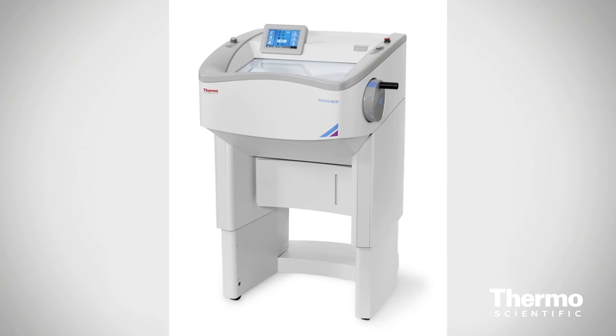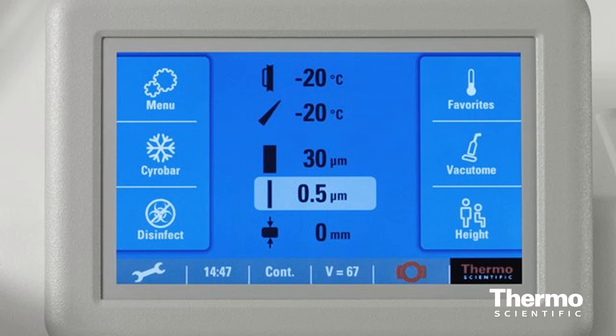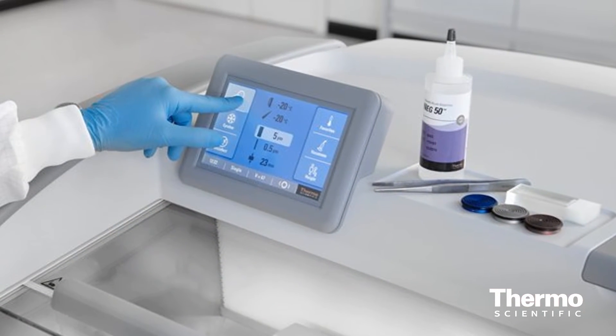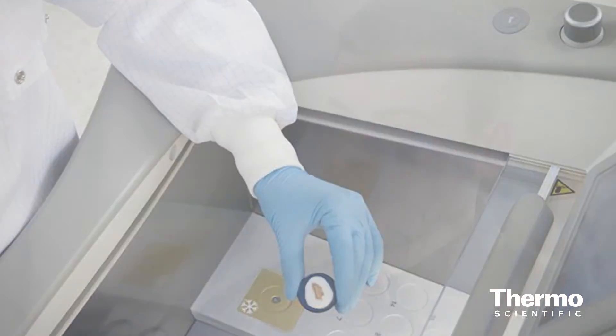Another big benefit of the NX series cryostats is that all the controls are available through the touchscreen interface. This allows just about anyone to come up to the instrument, intuitively understand how to use it, and get good quality sections. In summary, the NX series allows our customers to get high quality sections and to do so comfortably, safely, and efficiently.